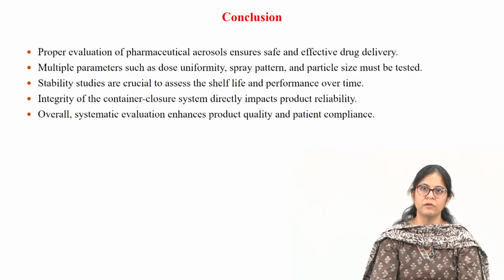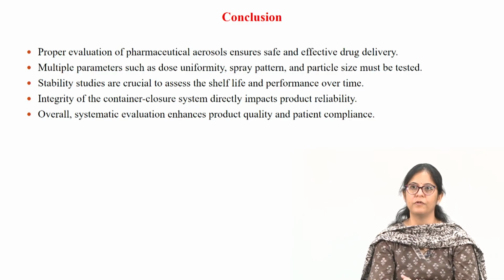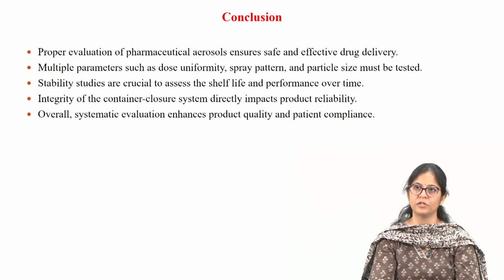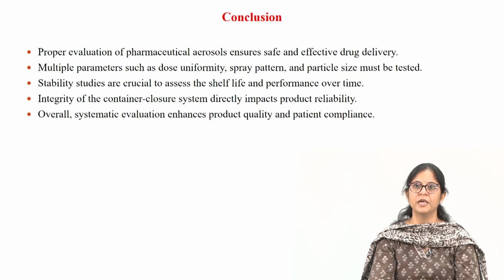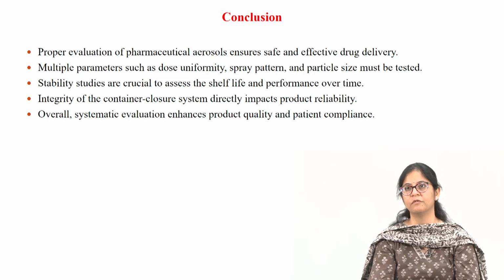So, to conclude, proper evaluation of the pharmaceutical aerosols ensures safe and effective drug delivery. Multiple parameters such as dose uniformity, spray pattern and particle size must be tested. Stability studies are crucial to assess the shelf life and performance over time. Integrity of the container closure system directly impacts the product reliability. Overall, systematic evaluation enhances product quality and patient compliance.